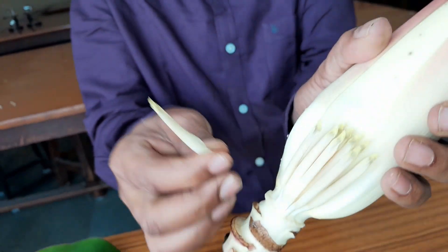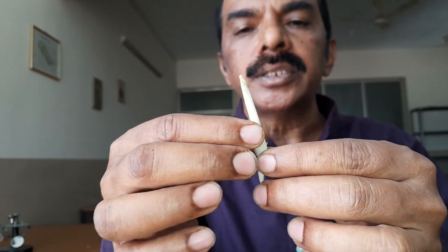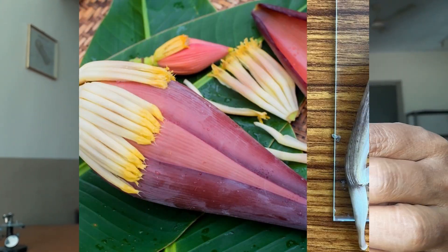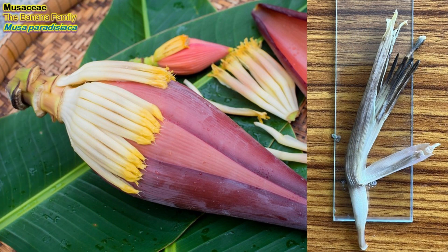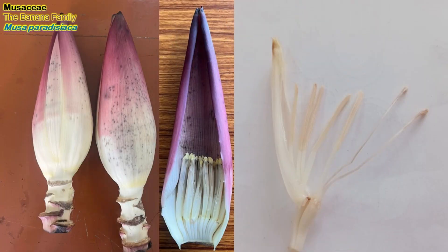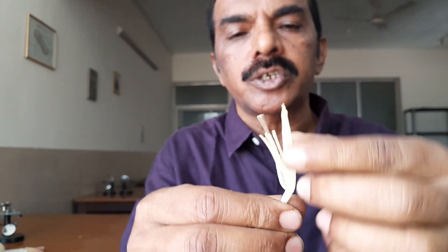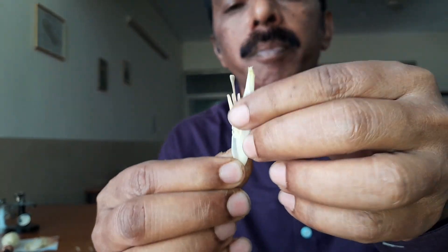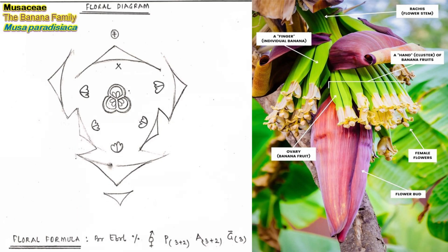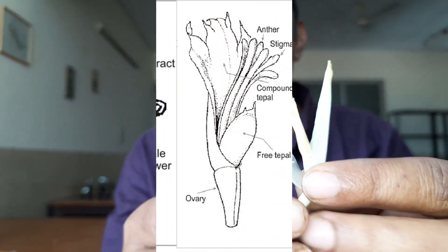I will take out one single flower. This single flower has an inferior ovary and these are all the tepals. There is no distinct calyx or corolla — there is a perianth with two whorls of tepals, that is three plus three. Six tepals are present and five of them are fused: three outer and two inner tepals fuse to form one large structure. The posterior tepal is free and looks like a hood enclosed within the remaining five fused tepals.